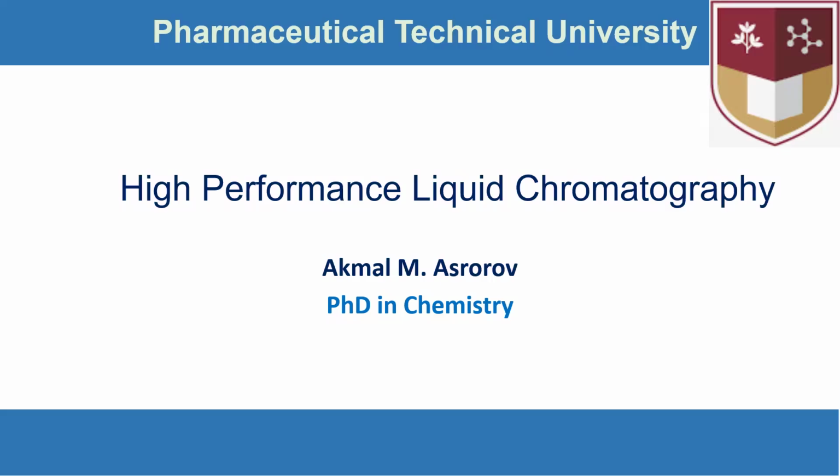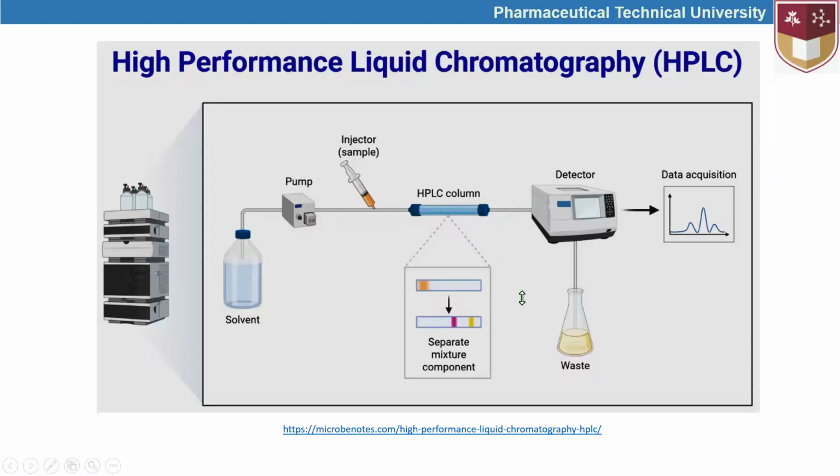Hello, in this video lesson we will talk about high performance liquid chromatography. Sometimes it is written as high pressure liquid chromatography. Both of them are considered to be true because high performance liquid chromatography uses high pressure. High performance liquid chromatography, further I will call HPLC.